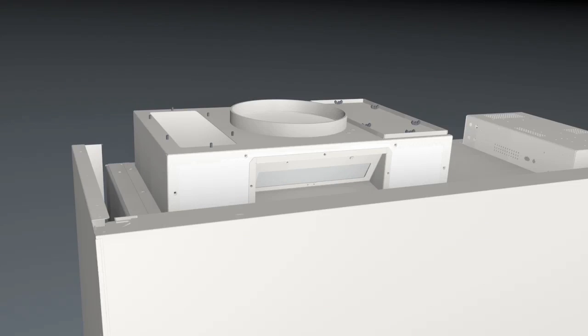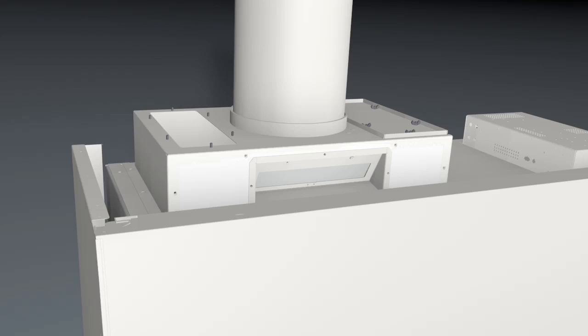To convert the Axiom to Type B mode, follow four simple steps. One, connect the cabinet to ductwork.